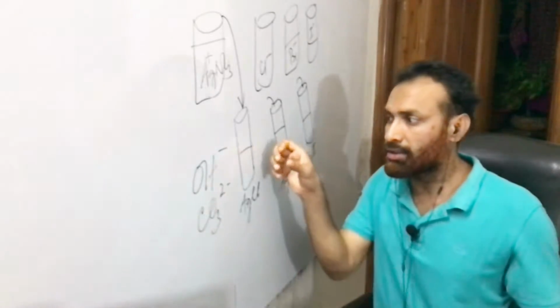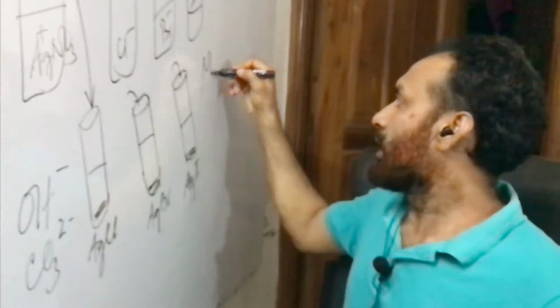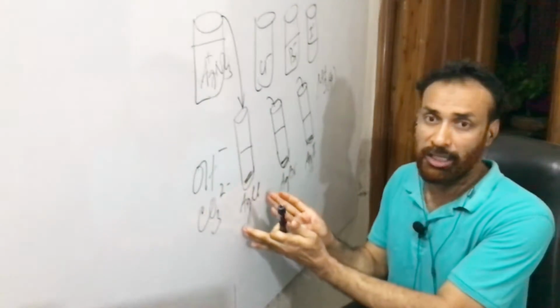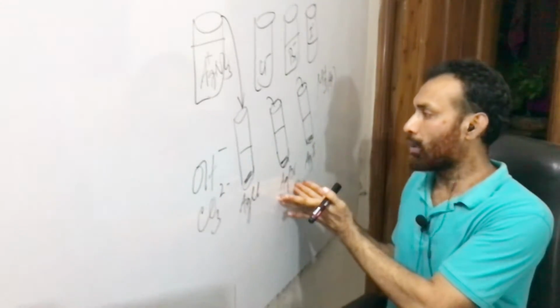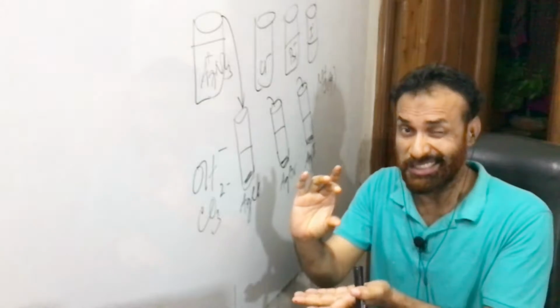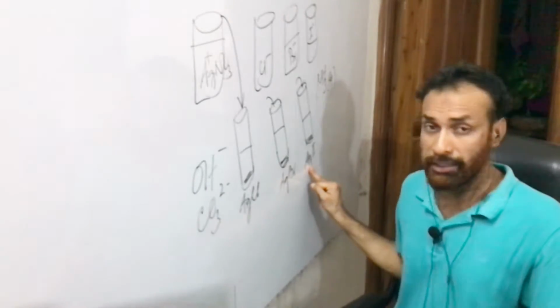What is that? You take only the solid of the precipitate. How to do that? Just decant and discard the solution, so you get only the solid. Then add ammonia solution, NH3 aqueous, to all the solids. Silver chloride, the white precipitate, would dissolve completely. Silver bromide, the pale yellow precipitate, will reduce in amount by about half. And there won't be any change with the yellow.